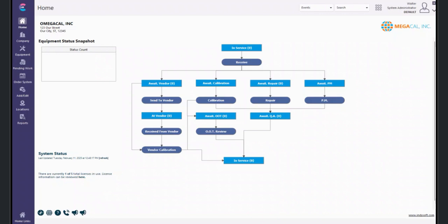Tip Tuesday Part 1 covered the revision level audit trail perspective. And Tip Tuesday Part 2, today, we will go over the robust testing objective evidence aspect of effective validated state. Today, we will share a change control document template, then show an example of an event configuration change displaying the calibration.com configuration change utility, and the change control form with an attached testing script.